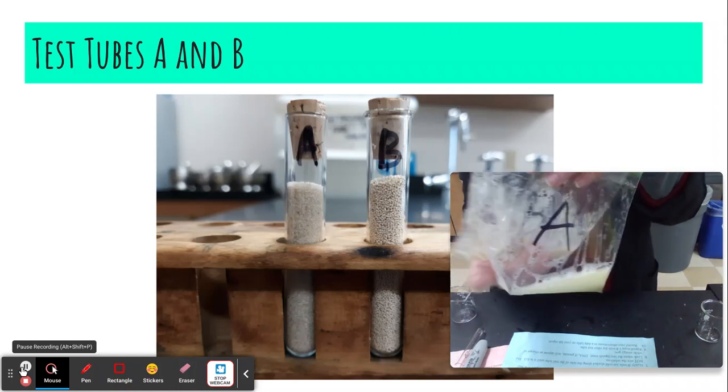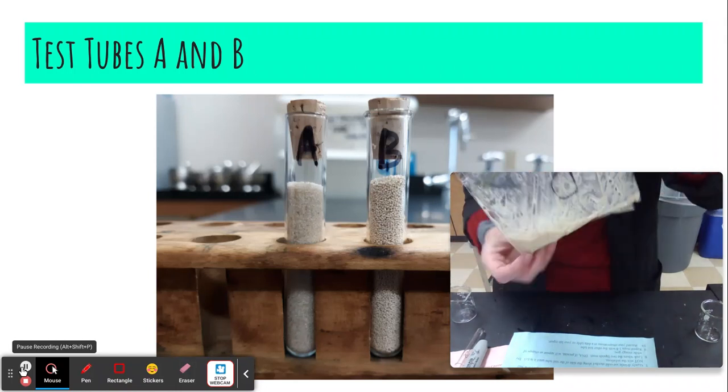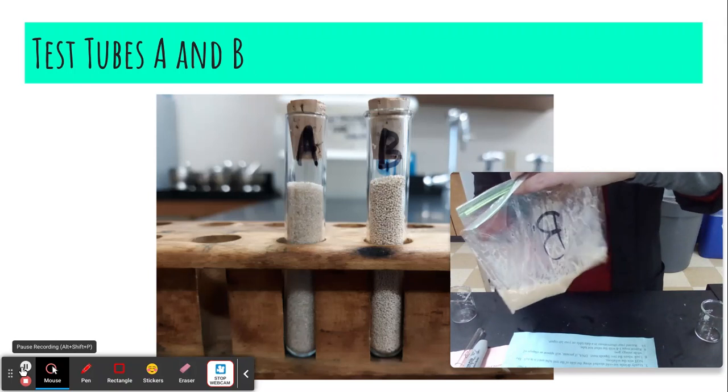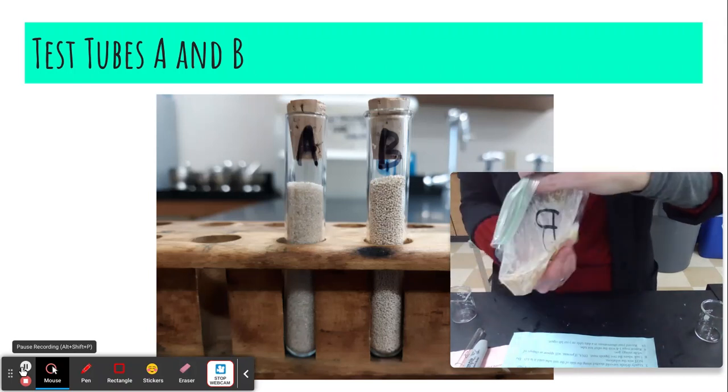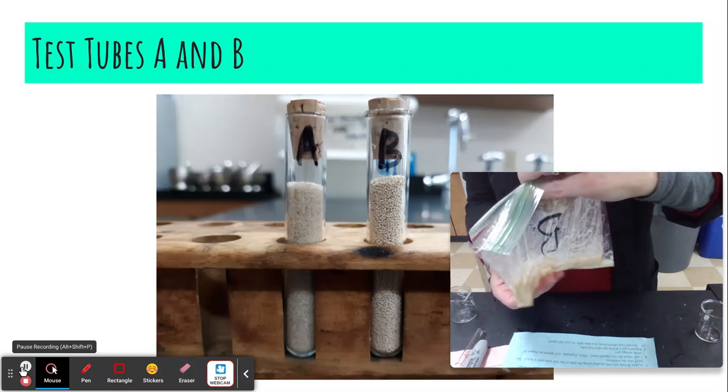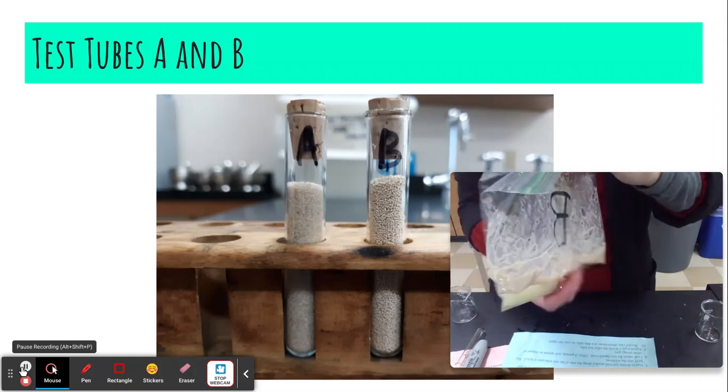And I will tell you that that's a lot harder to do when you don't have a partner. So hopefully I won't make a total mess out of it, but you can laugh at me if I do make a total mess out of it. Okay, those should be mixed up enough. I think we're ready to go.